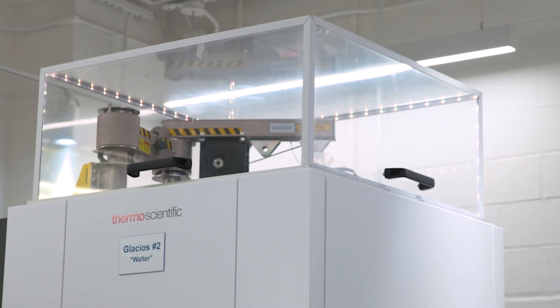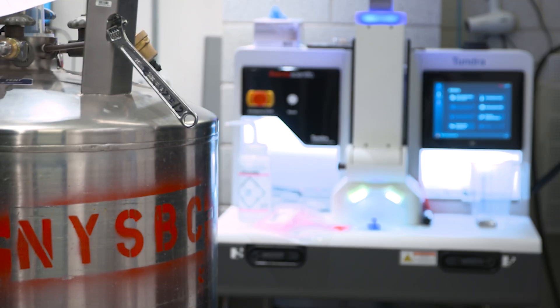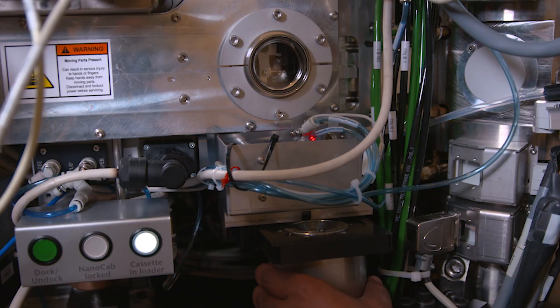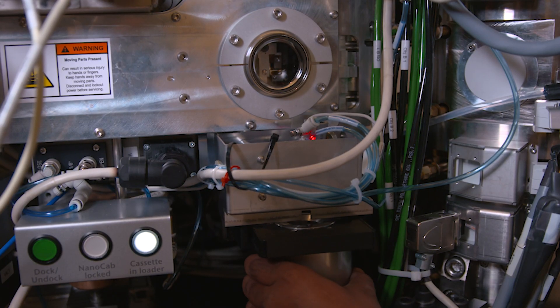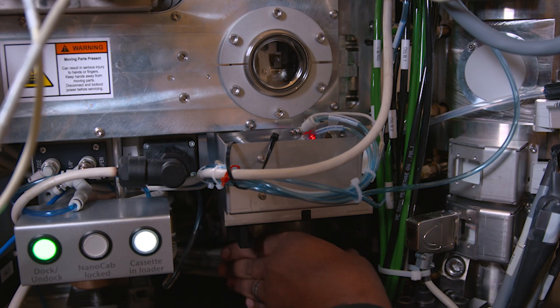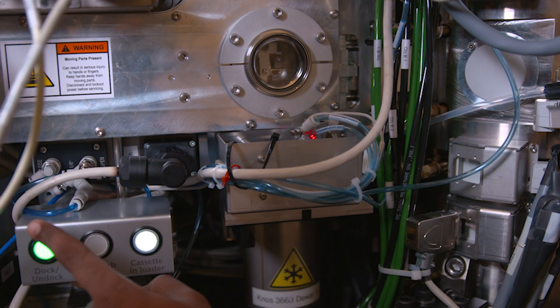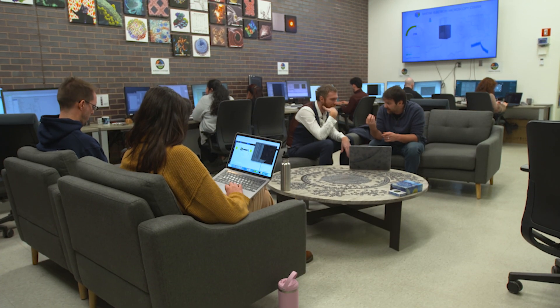The team at the Simons Electron Microscopy Center is, I think, its greatest strength. We have these amazing, beautiful instruments, but it's really the staff that lets us do the kind of work that we do. We have people with a broad range of experience. We have engineers, chemists, physicists and biologists, and that allows us to tackle any problem we might come across.